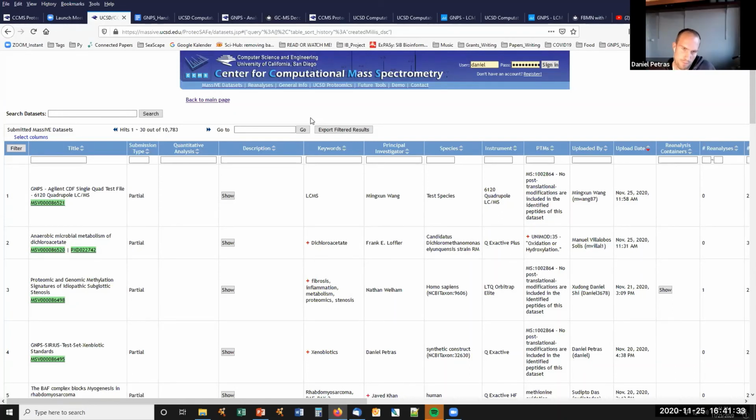From a practical day-to-day usage standpoint, we also have a NAS system in the Dorrestein lab. I know UCSD has different servers where you can have external storage. I typically have a backup on my computer, then one on our local server, and ultimately I try to upload my data to MassIVE relatively fast, because of all the places I can put data that's probably the safest, since it's in the UCSD Supercomputer Center, and that is double backed up. So there should be a very small likelihood of any data loss here.